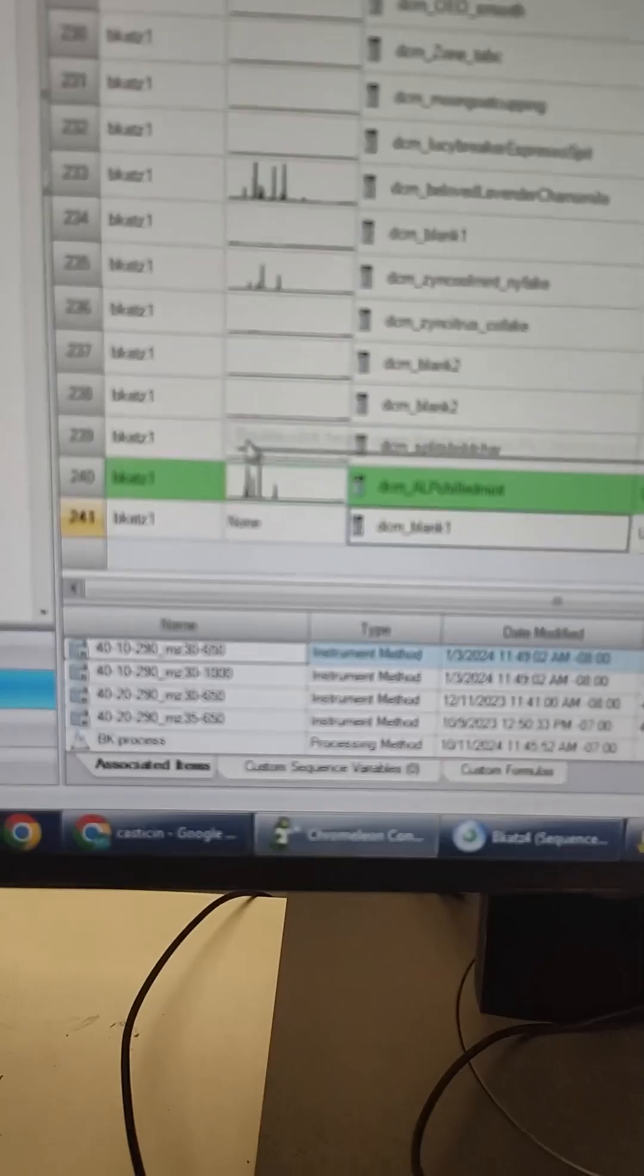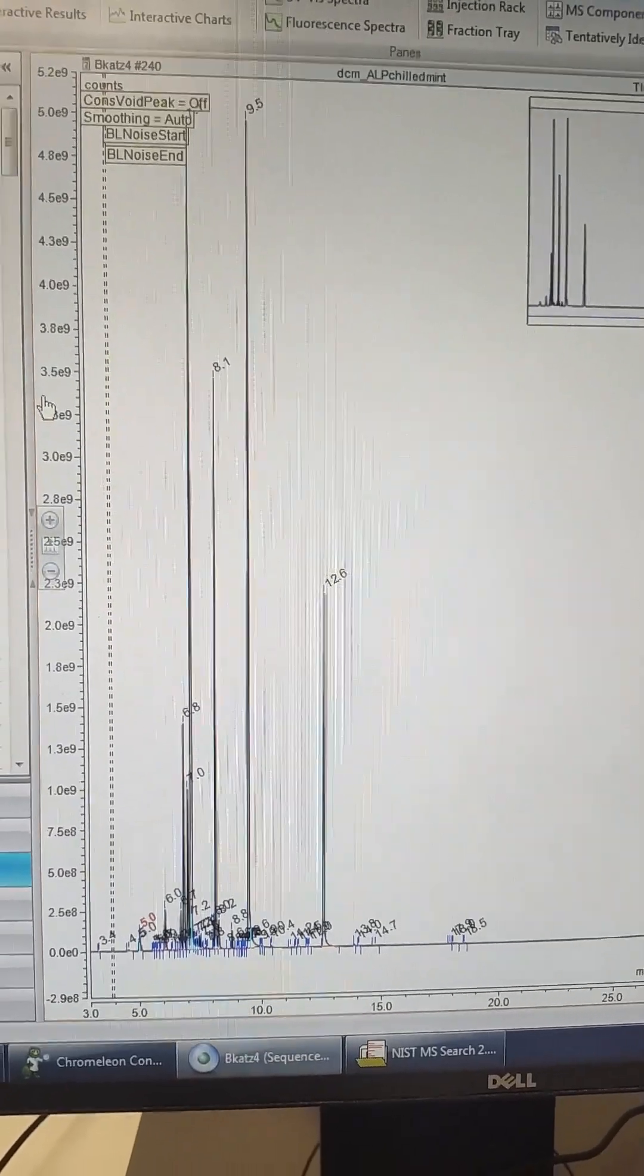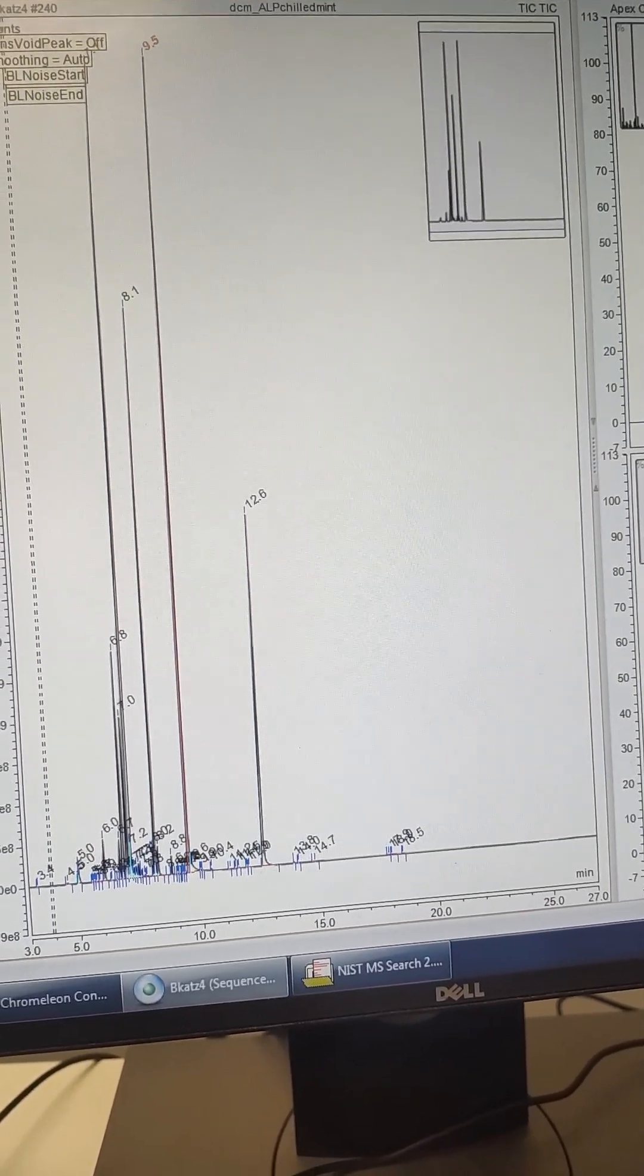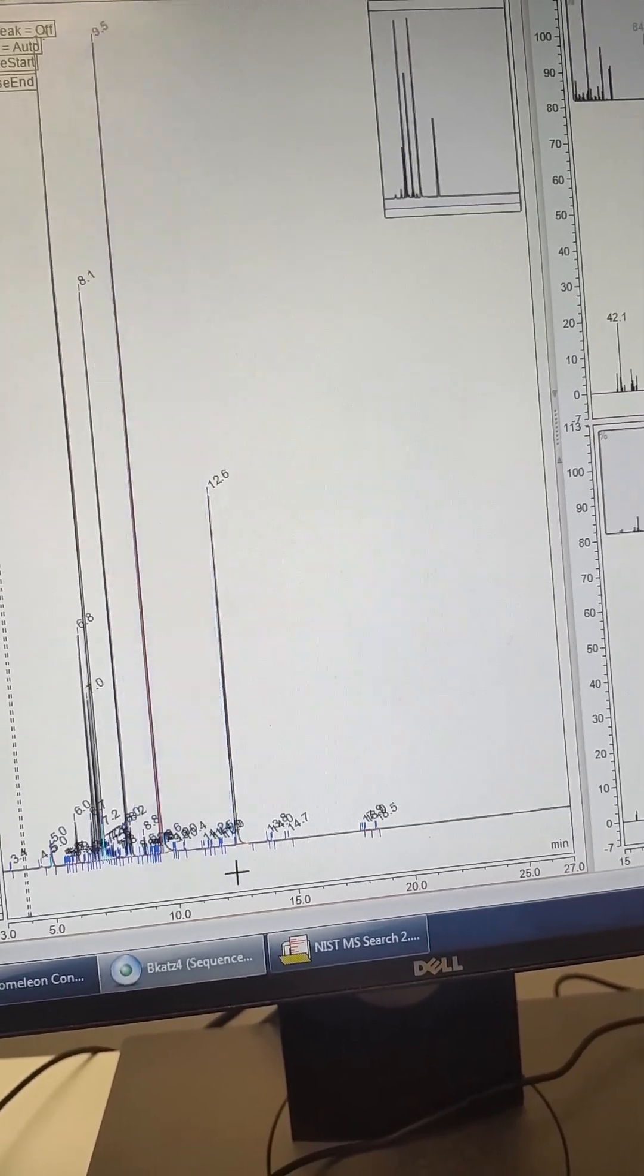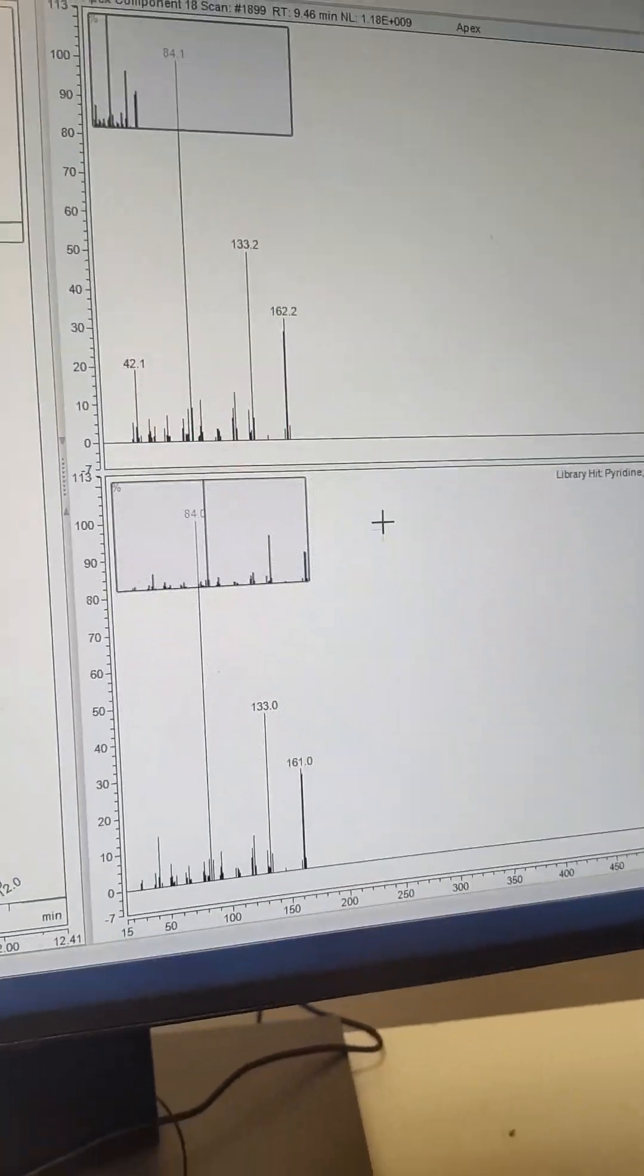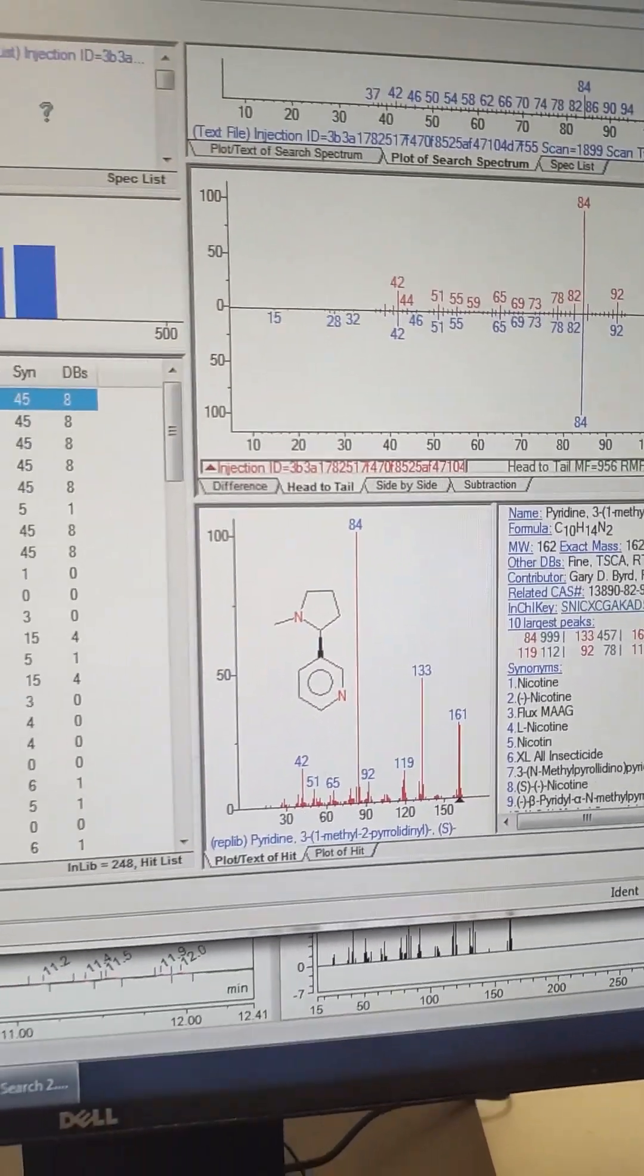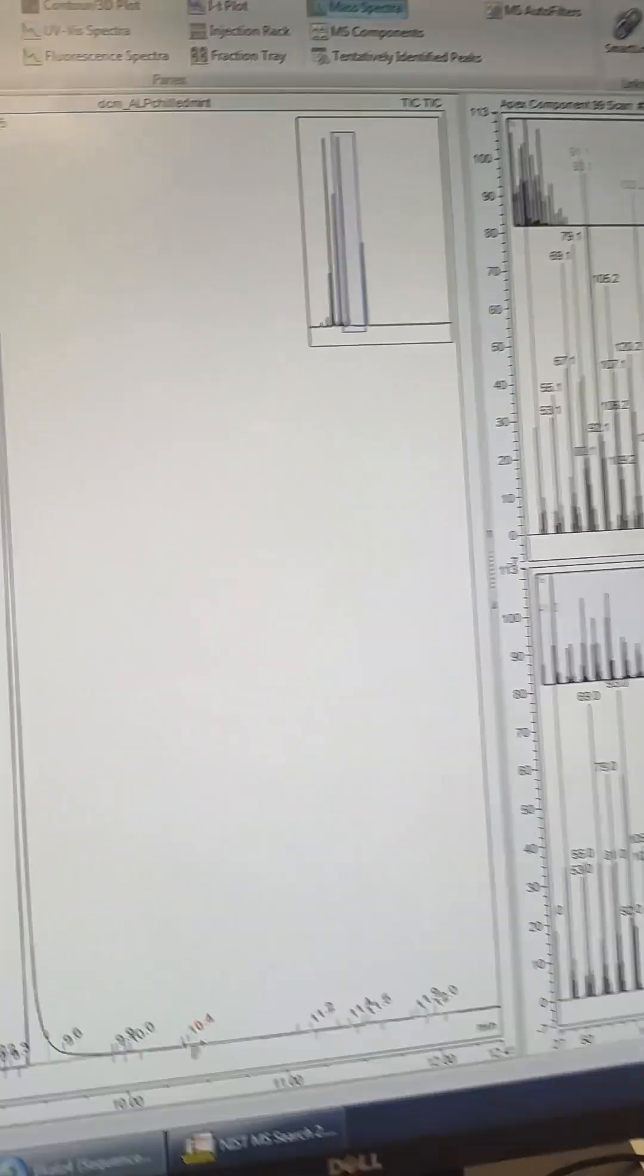All right, here it is off the GC, the ALP chilled mint, long awaited data. I put a bunch on there, I mean I'm not going to say overloaded but boy, 5 to the 9, I don't know that's a lot. So anyways we'll see any minor impurities if they exist. That first big clean peak right down the center, we're going to check down, no minor impurities or bumps. We're seeing this one at 10.4, we'll dig into that next, but that's your nicotine and let me tell you that's looking pretty clean. Good job Tucker, no complaints there.